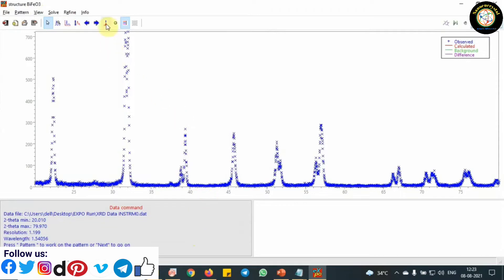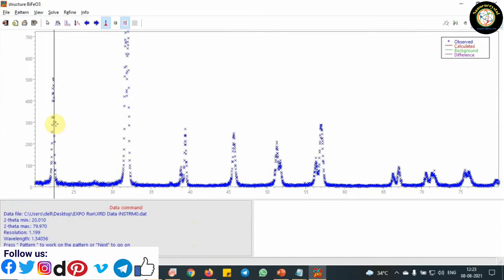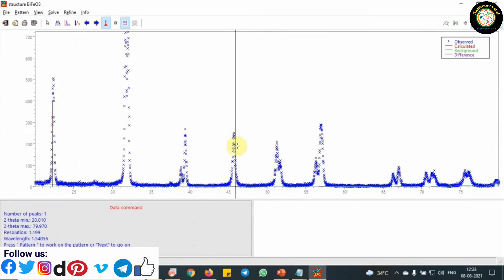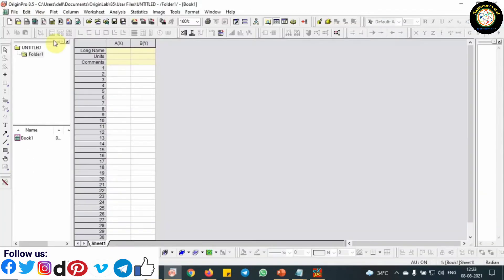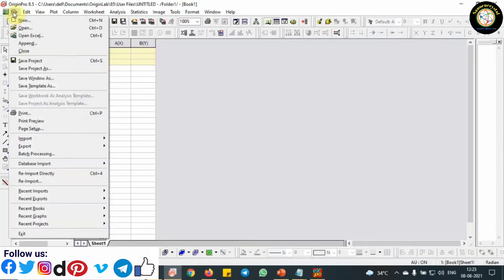Using this tool, you can fit individual peaks manually. But you can use Origin software to identify exact peak positions. After that, prepare your peaks list with the help of Origin software.